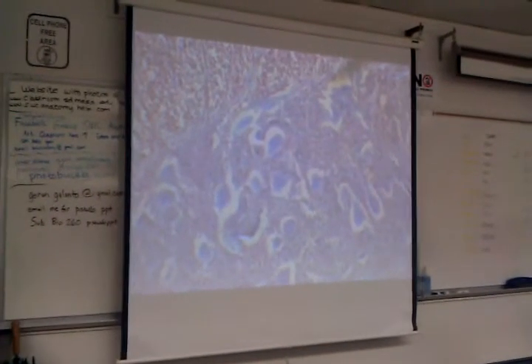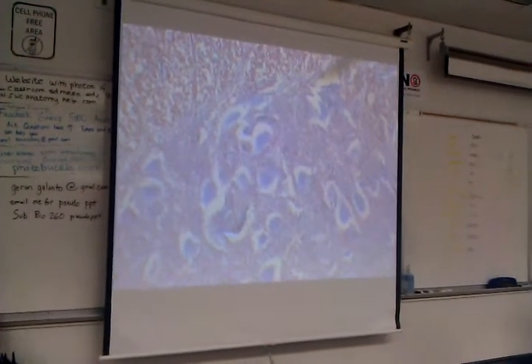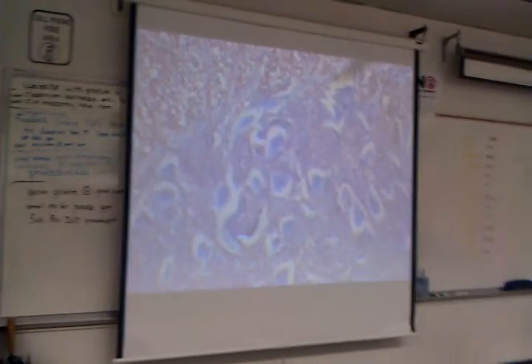So those are motor neurons? They're motor neurons. What's the thing in the middle you said? The central canal. Yeah. There's not as many as those, probably. No, they're not.